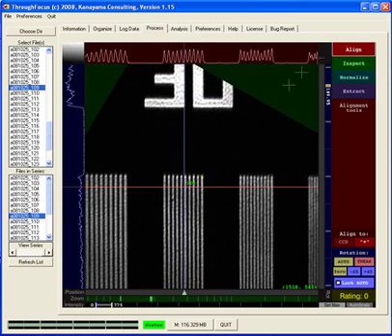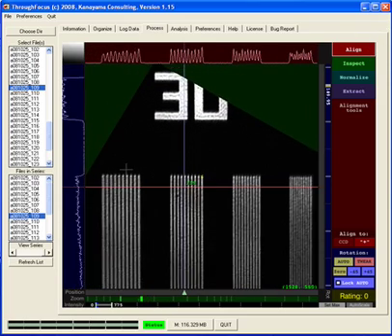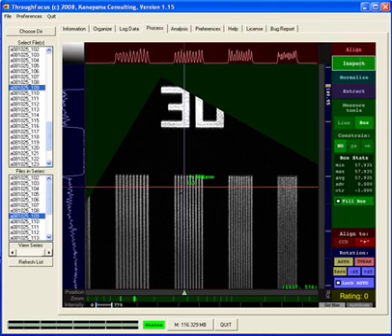So what we'll do is we'll select a region that we're interested in. So let's use this inspect tool. And now the idea here is to draw a box around the part that you're interested in. It's really important to do the align step first because the box position is relative to the alignment position, the little cross. So I'm going to draw a box here.